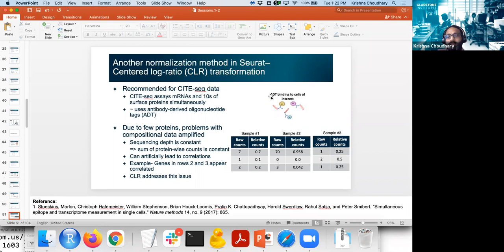And the way it is done is using antibody conjugates, complexes of antibodies with oligonucleotides. So they have engineered these antibody-oligonucleotide conjugates, and there are a bunch of antibodies which are available from them. I don't know who is supplying them, but I guess the lab or the vendor or someone. But these antibodies can target some of the surface proteins in certain kinds of cells where they are expressed.